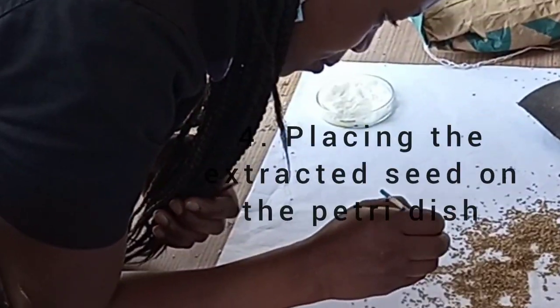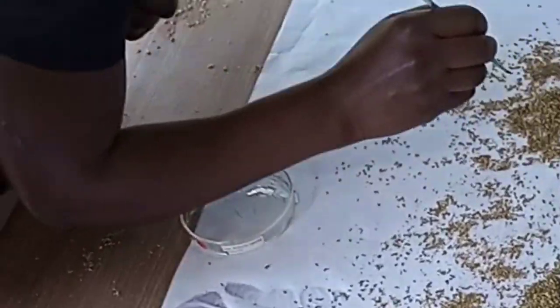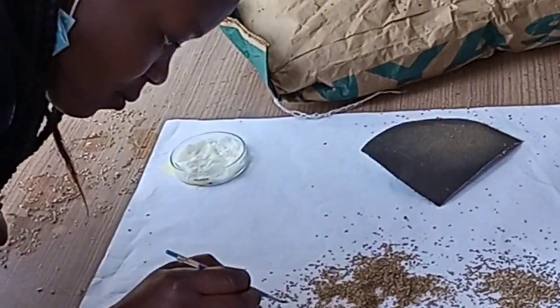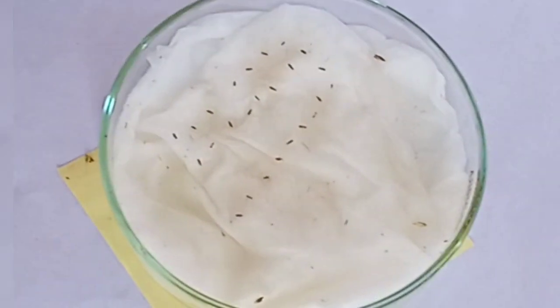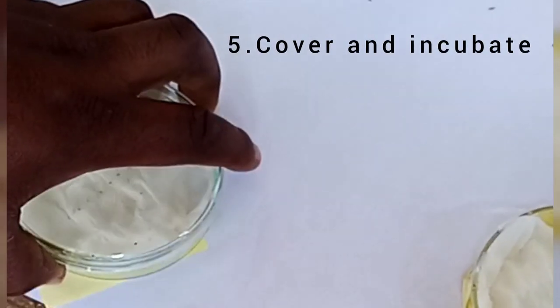After that, you collect the naked seeds and place them in the petri dish while you count for easy computation of percentages. The seeds are very tiny, so you place them in a pattern so that you can see them easily. Then cover and incubate.